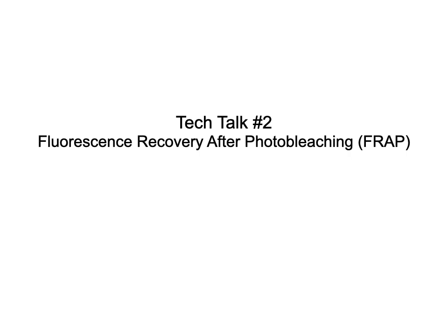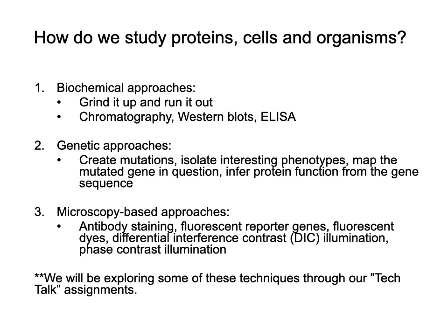Okay, so these are the slides for our second tech talk, and the focus for this tech talk is going to be fluorescent recovery after photobleaching, or FRAP. Just as a reminder, we have our three different approaches for studying proteins. This falls under microscopy-based approaches.